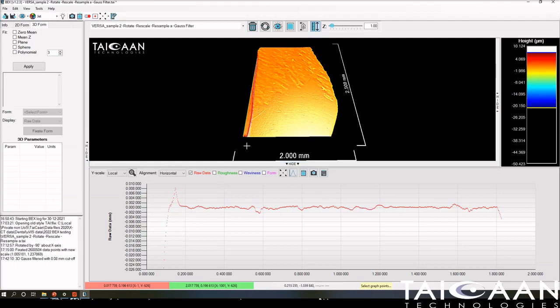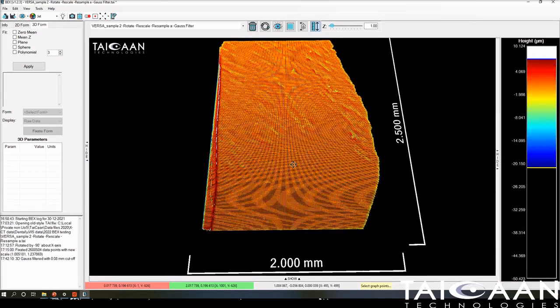We've got some features on the left-hand side here. We're not interested in that, because what we're interested in is just a small section where the acid has been applied, so the kind of region that I'm pointing the crosshair to currently. So how do we do that? So let's just remove this and have another look.